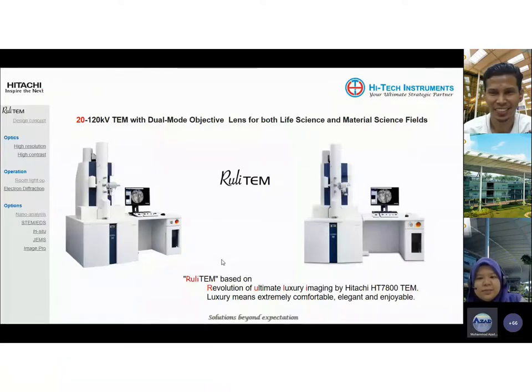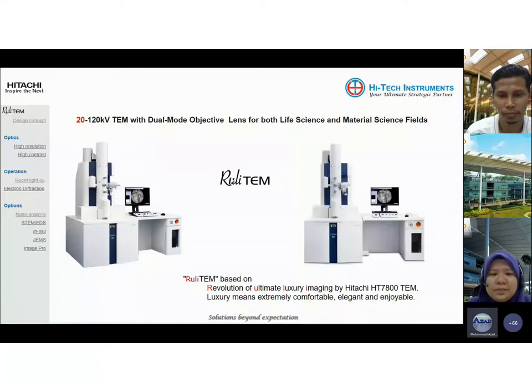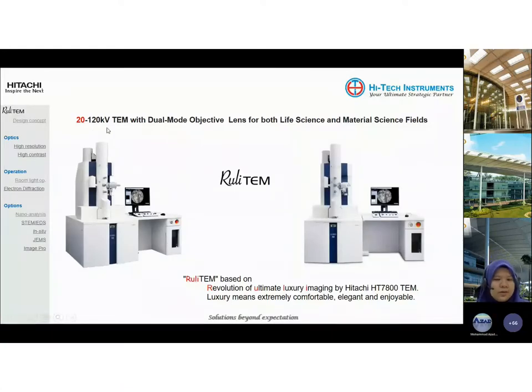Thank you. So good morning, everyone. The presentation today is actually to expose you all, especially to the TEM that you have in the center, called UTP. It is a revolutionary imaging, luxury imaging, using this 20 to 120 kV TEM with a dual mode objective lens. It's applicable for both life sciences and material science.